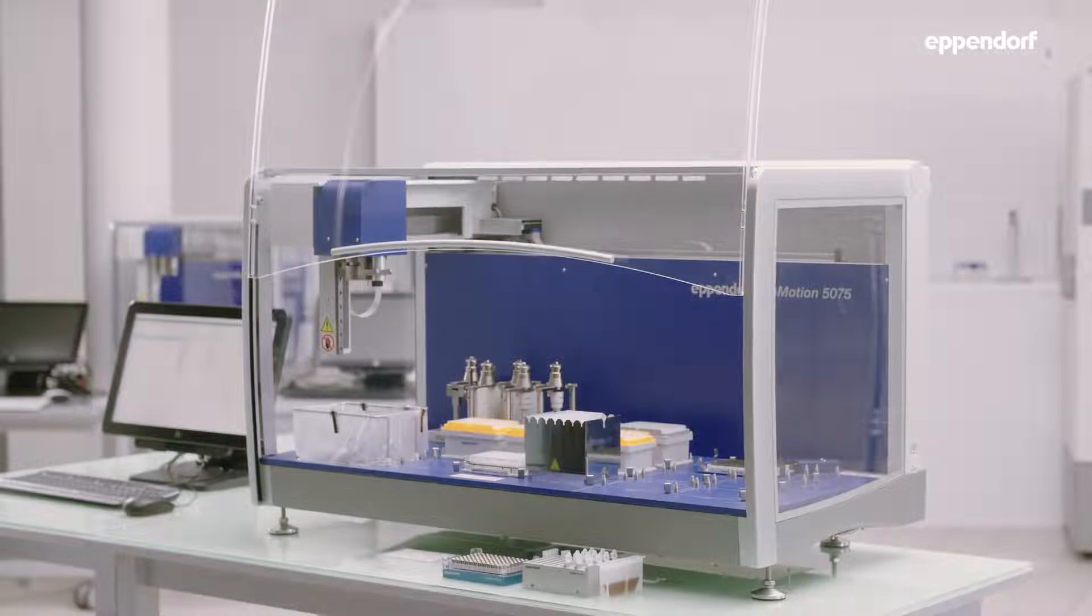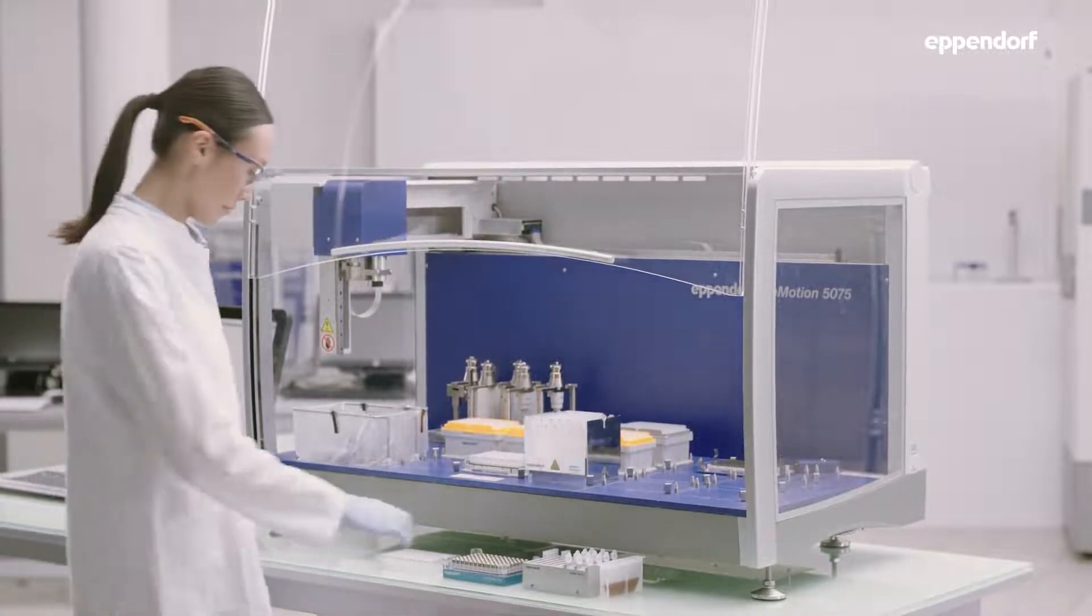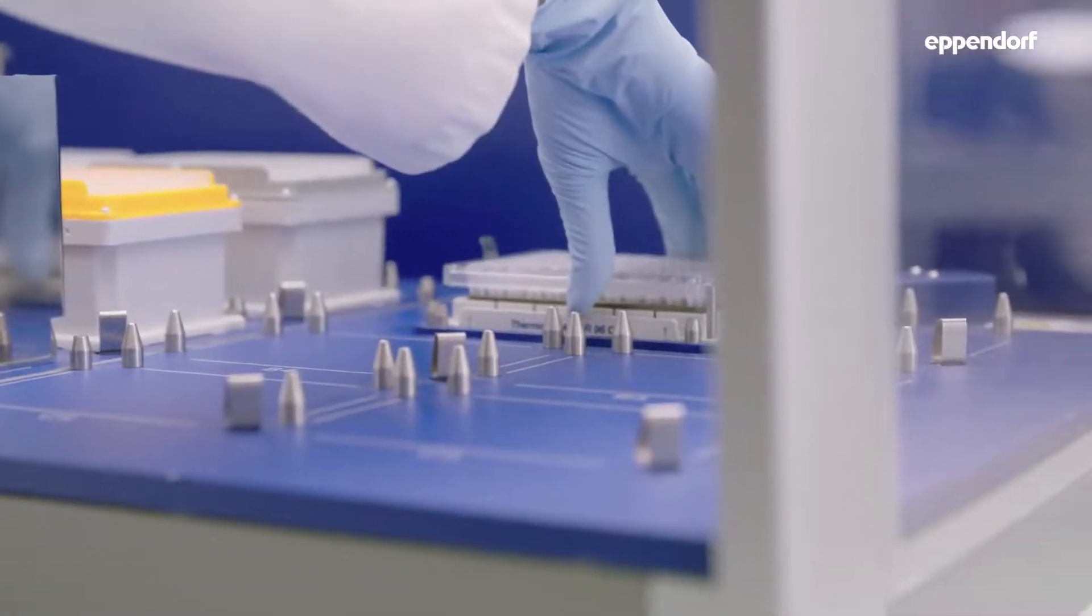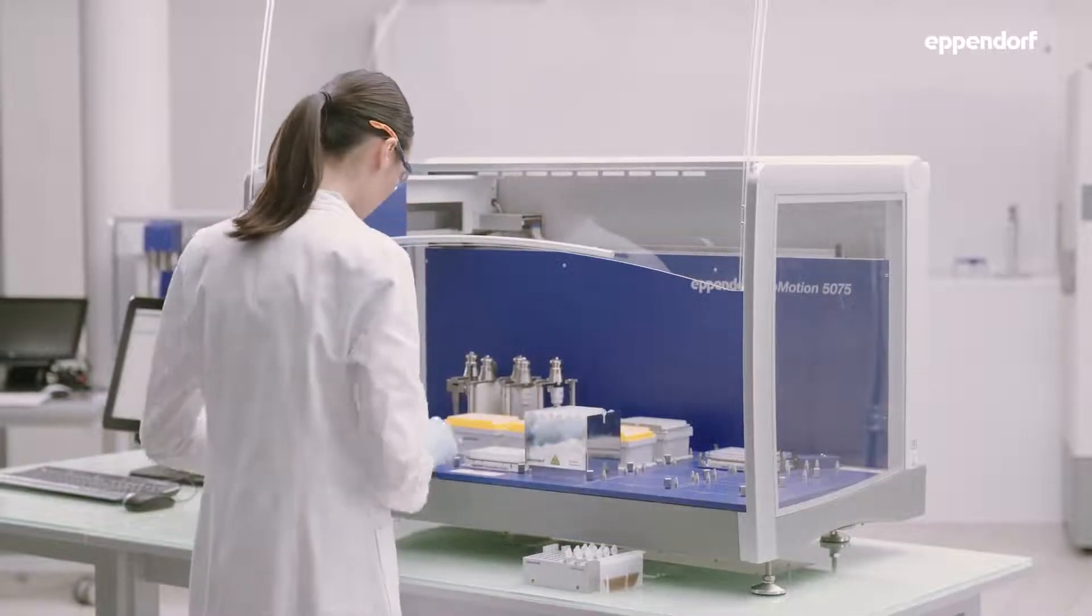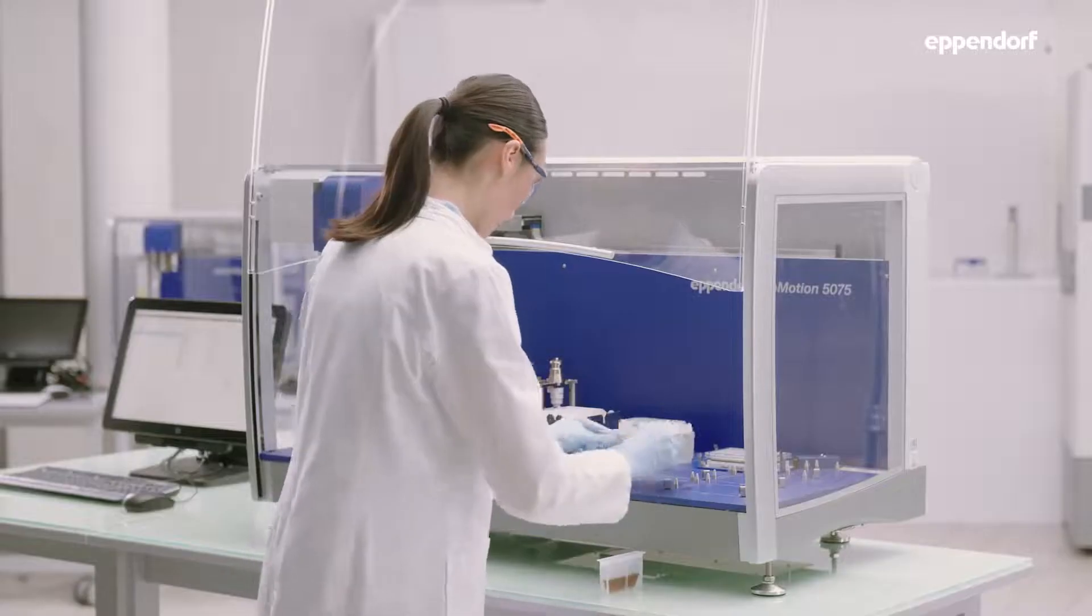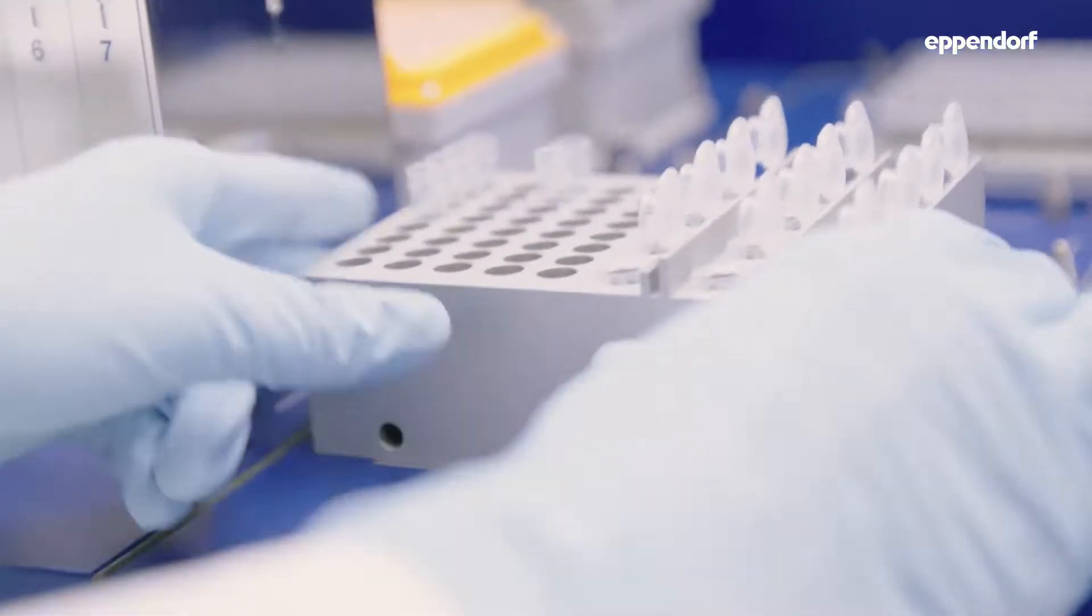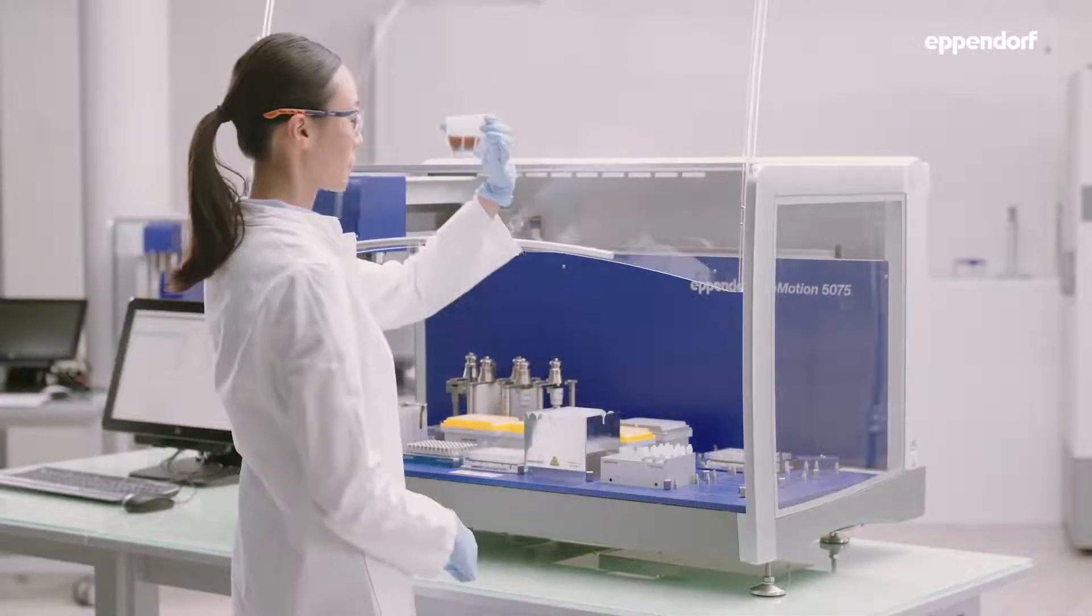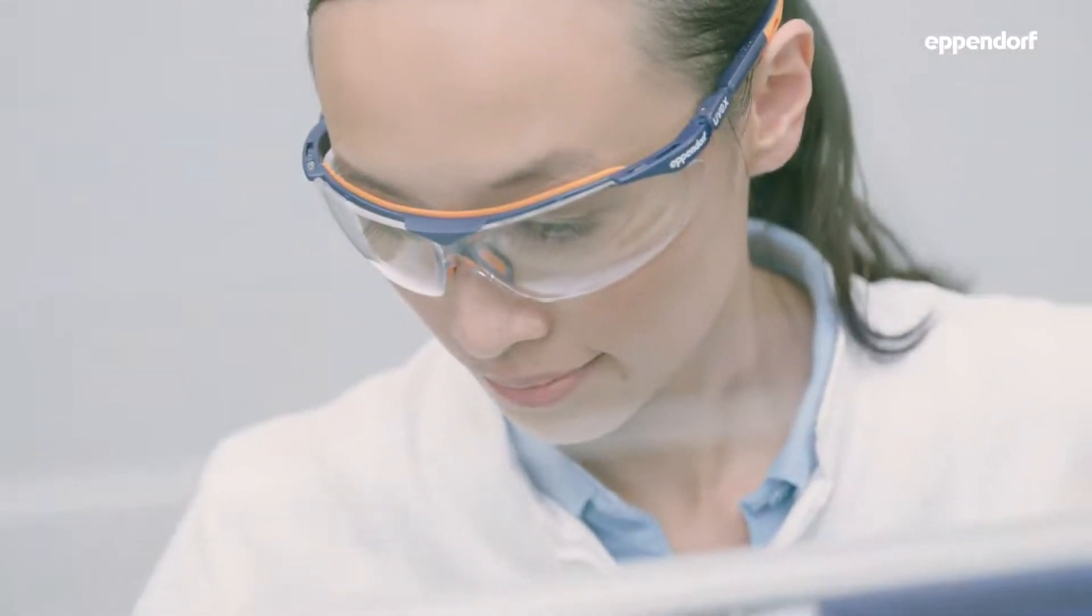To perform bead cleanups on the EP-Motion, the device must be equipped with the sample plate, a 96-well magnet plate, reagents like wash and elution buffers, and pre-homogenized bead suspension.